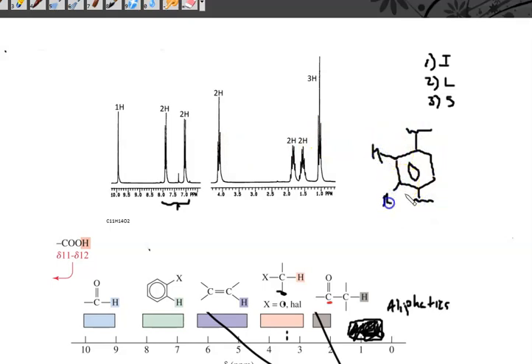Because it's a symmetrical molecule, it shows that on the NMR. But if you put it as ortho or para or meta, it doesn't matter, as long as you knew it's a di-substituted aromatic ring. And the way we know it's di-substituted is how many hydrogens total are on a benzene. There are 6 hydrogens total. Well, if this is telling me a total integration of 4, that means 2 of the hydrogens are gone. So that means 2 of the spots on the aromatic ring have groups. Okay? So that's what that tells me.